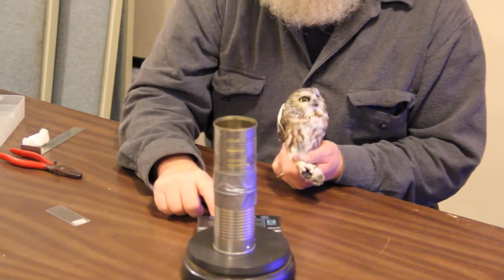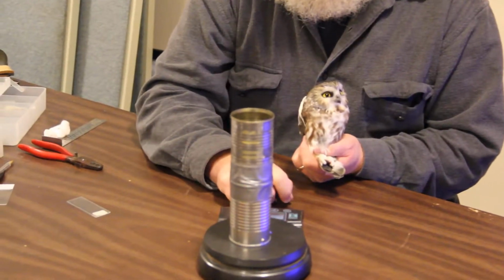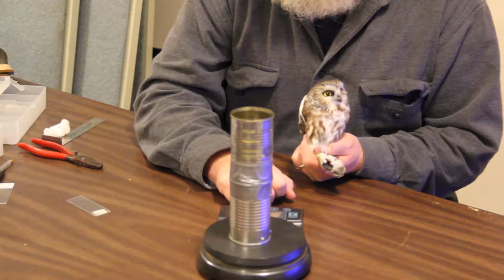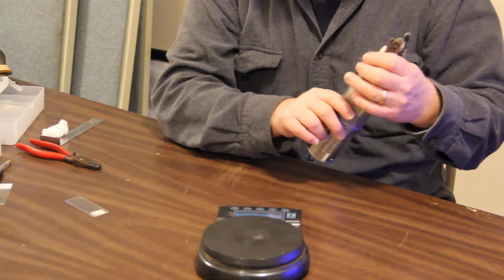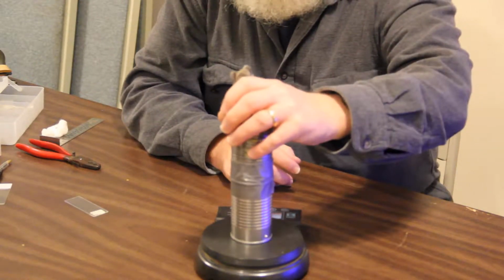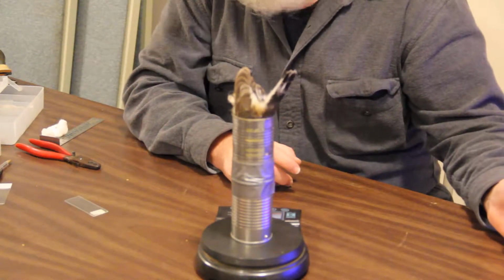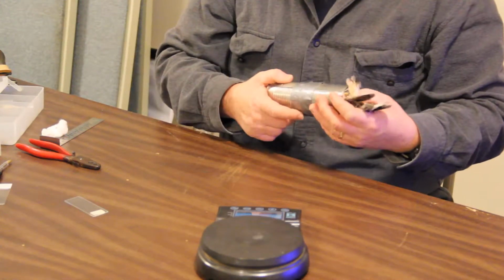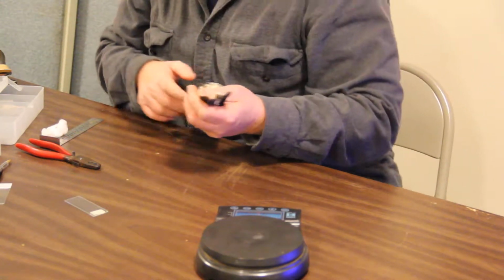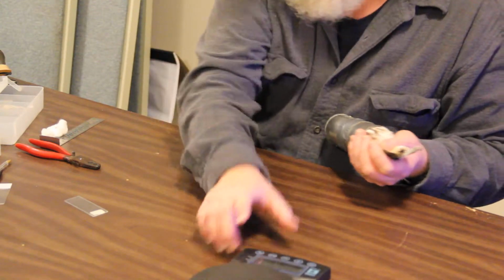So what he's doing now is he's going to tare that. So the can we're going to use to weigh it and process it so it can't fly away, and he's just subtracting the weight of the can from it. And now he's going to take the mass of the bird. And we do this before we band it. We do this because the band itself has a little weight to it. So before we put the band on, we get the actual mass. It's more exact.